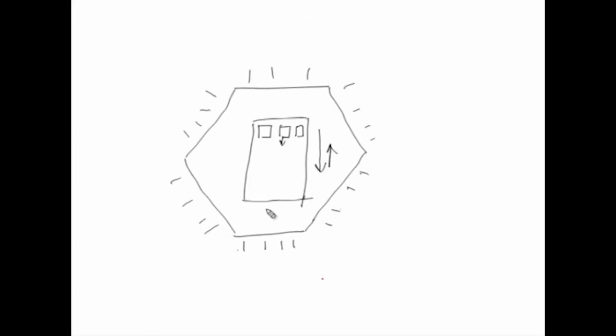In the programmable controllable pattern, each of these electrodes can be separately controlled. In clamped homogeneous or field inversion, each leg is controlled separately. But in the programmable autonomous control system, each of these electrodes is separately controlled, and you can generate various types of variations or directions in which the applied electric field could be applied, and so it is much better.